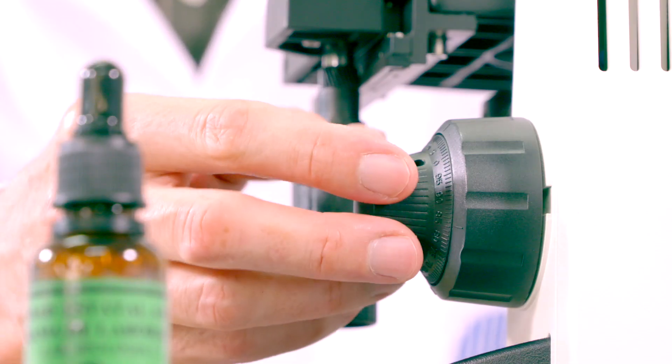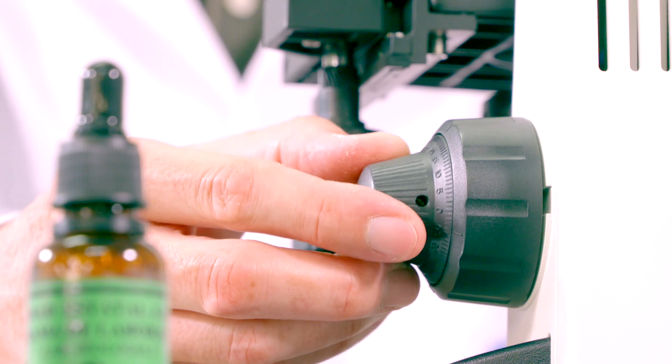Y, de nuevo, con la perilla micrométrica, vamos a enfocar bien nuestra muestra. Aquí, ustedes pueden observar mejor las células.